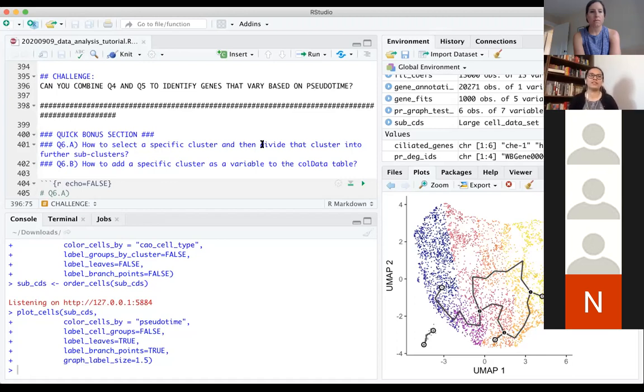Also, one other thing to mention: when you clearly don't have progression data, it's not worth doing trajectory analysis. It's going to give you inconclusive results, which will confuse the analysis even more. Fit models works much better in that case, and it's quite robust. And you can always add extra variables, which helps with accounting for the different variables in your data. So take a call based on what the data is.